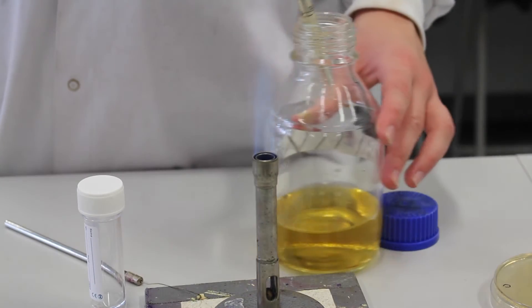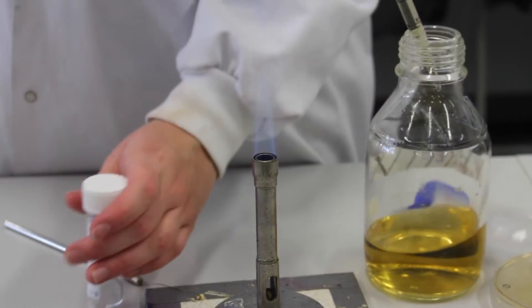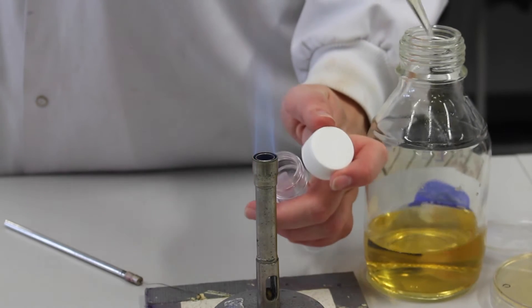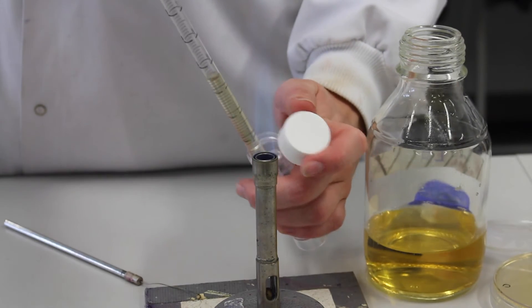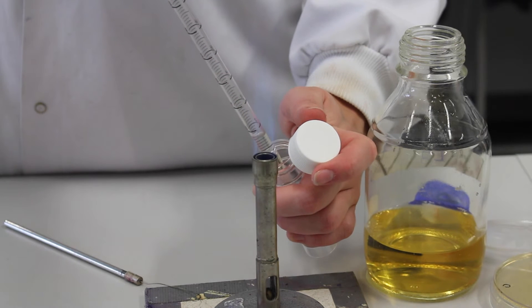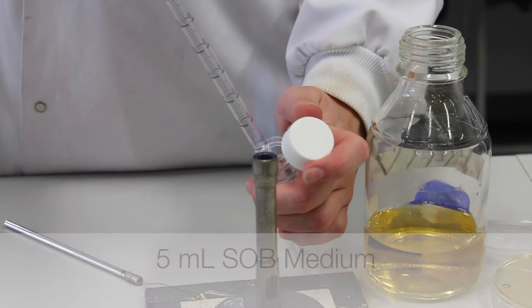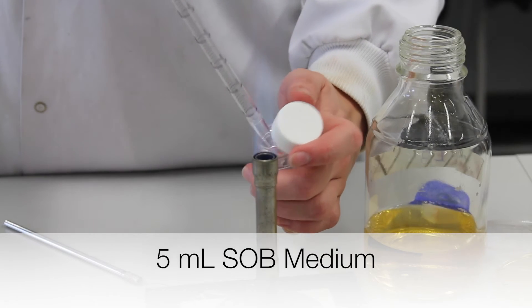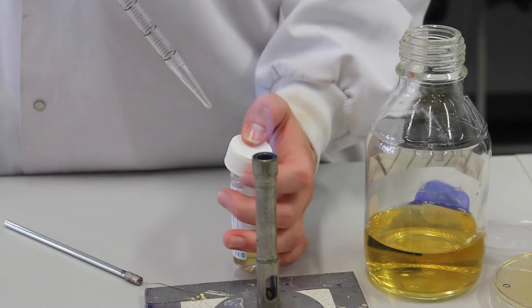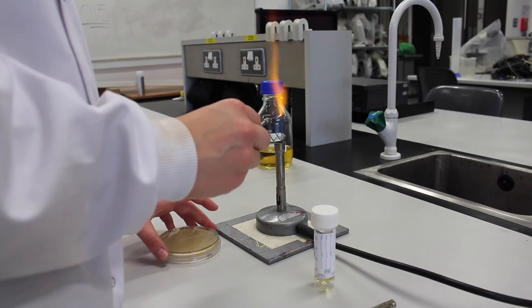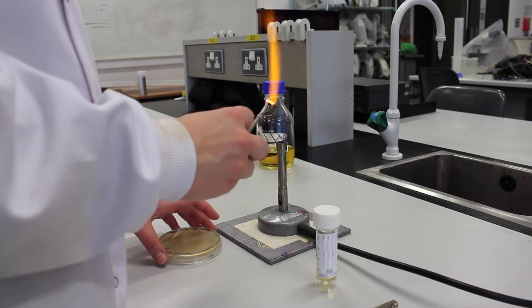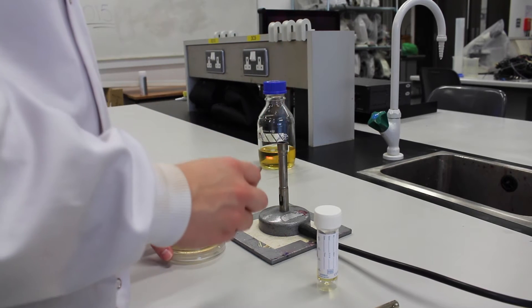The Bunsen burner will provide aseptic conditions to prevent contamination. The first step in preparing competent cells is to grow and create a stock of a bacterial culture. 5 ml of SOB medium is transferred to a tube. The inoculation loop is sterilized by passing it through the hottest part of the flame. It's allowed to cool.